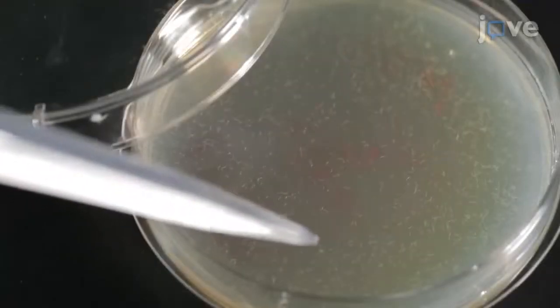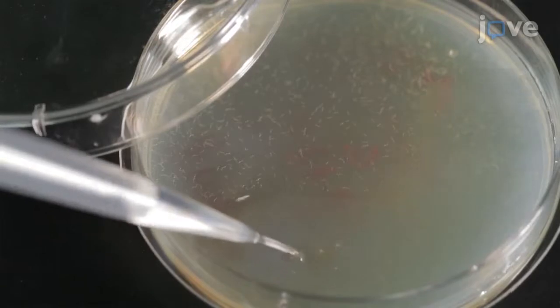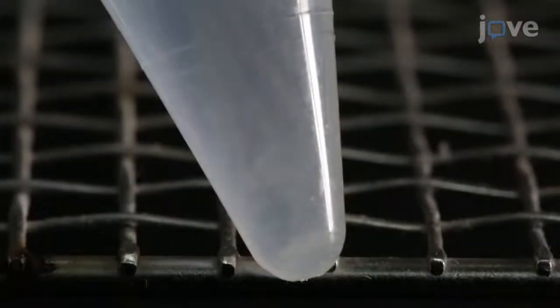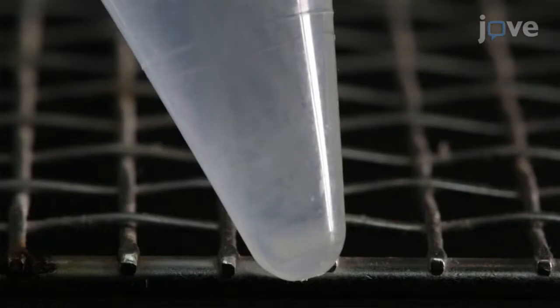To begin, wash approximately 2,000 gravid adult worms with sterile deionized water. Repeat the wash three times, keeping the worms at the bottom of the tube.